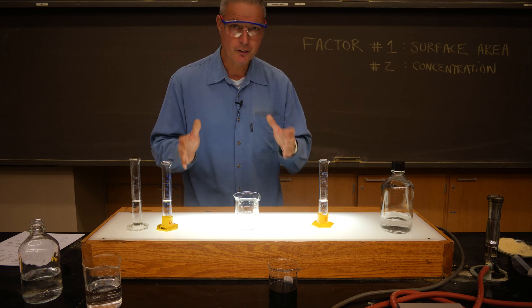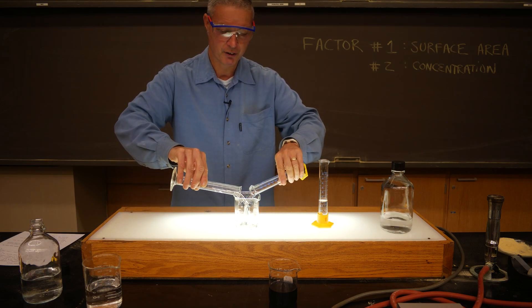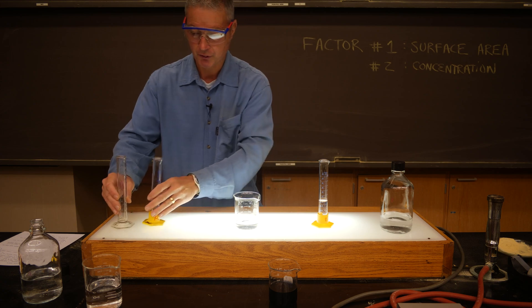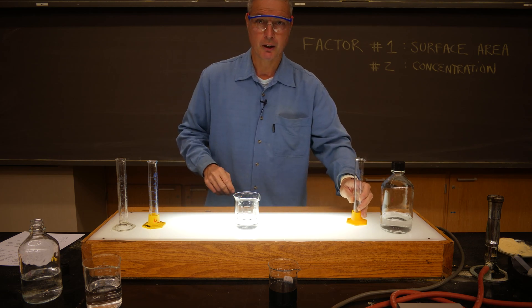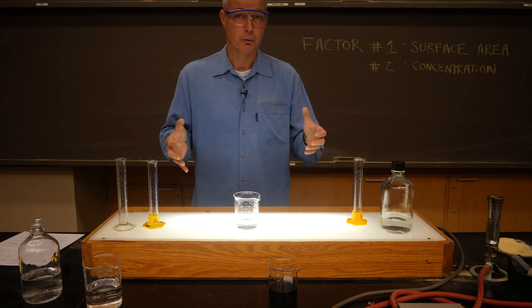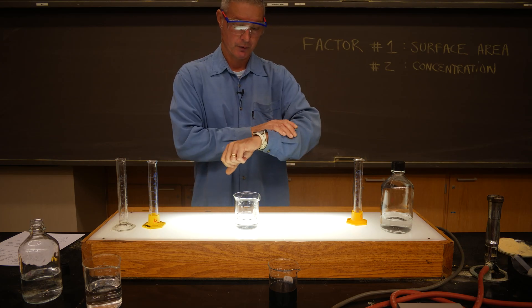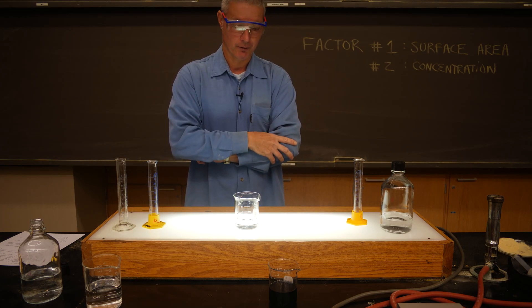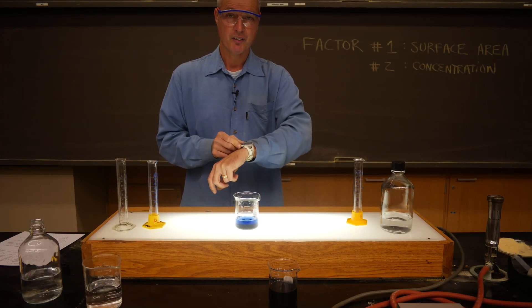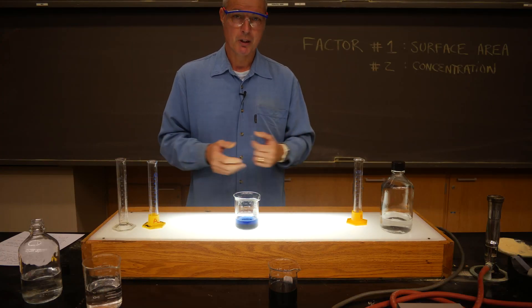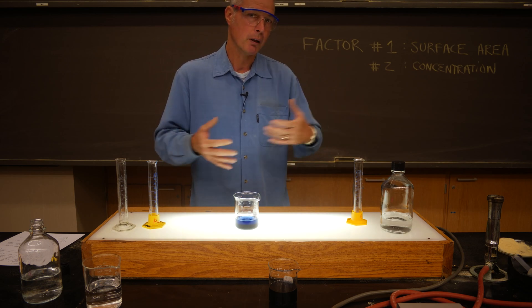This time I'm going to cut the concentration in half by diluting it by half with water. How much do you want to bet the time will go slower, because the molecules can't bump into each other as often? Last time it took 14 seconds — there we go, 35 seconds. Basically cut the concentration down, molecules bump into each other less, the reaction rate is slower.